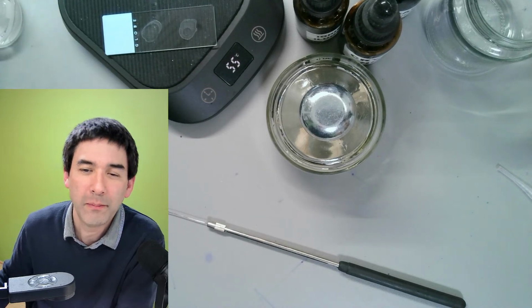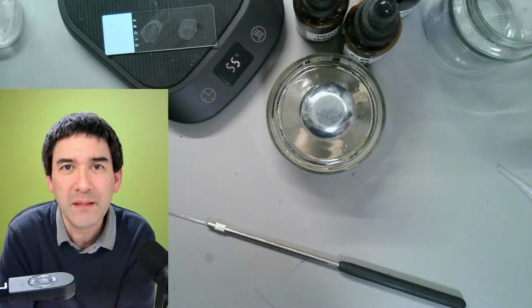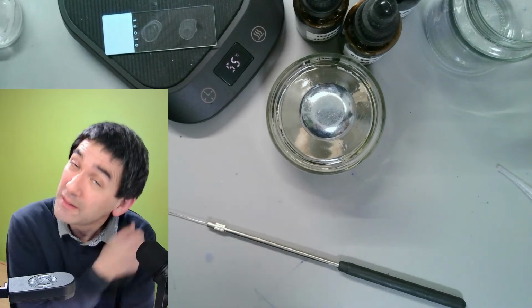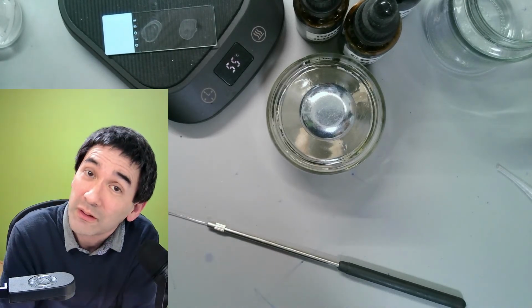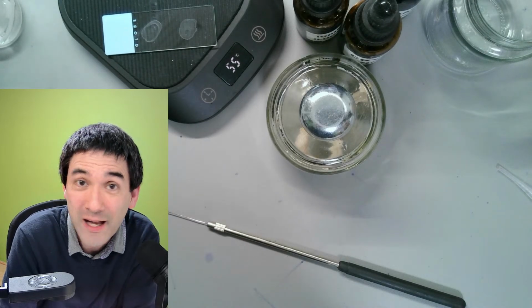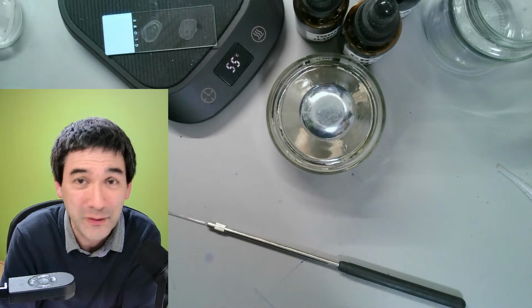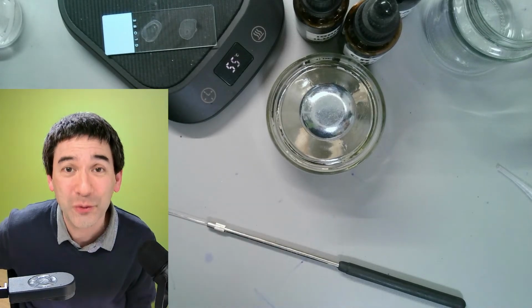Are we going BSL2? What is BSL2? This is basically biohazard safety level 2. Strictly speaking, every time when you are rotting food in your refrigerator, you are already in biosafety level 2. When food is spoiling, you don't know which bacteria are growing there, so, strictly speaking, per definition, you're dealing with unknown bacteria.